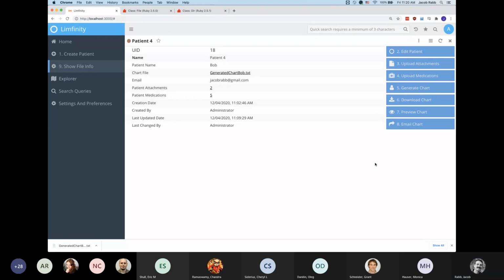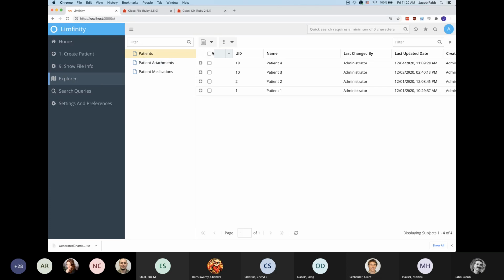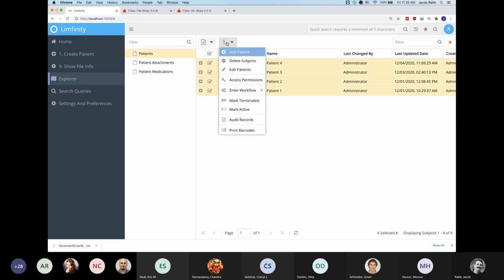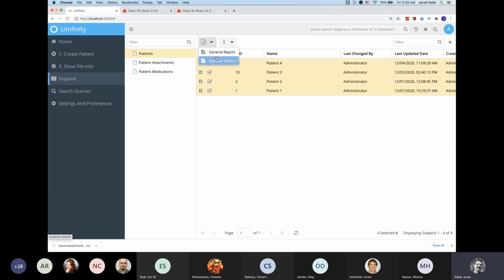Hi, Jacob. This is Chandra. I had a question from NIAD. They were asking, remember that every time you open a reporter, like you wanted to print a report, it gives you only a CSV option, right? I know it's a framework, and if they click a tool and generate a report, and it shows up a dialog box, can we manipulate that? Yes, if you go into that, yes.